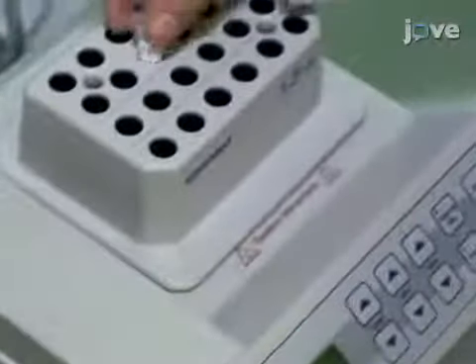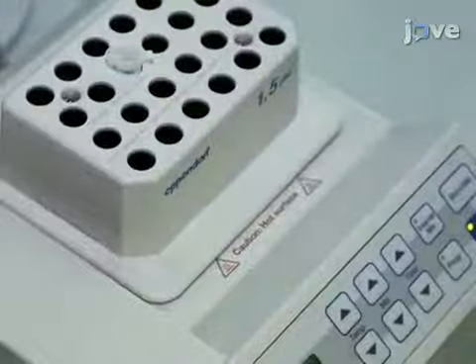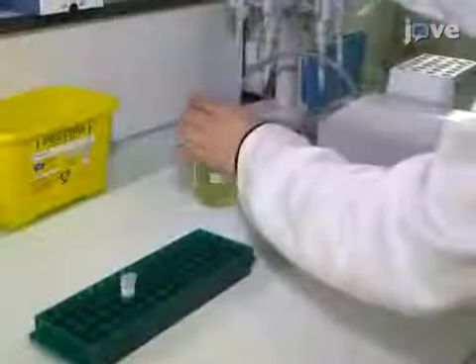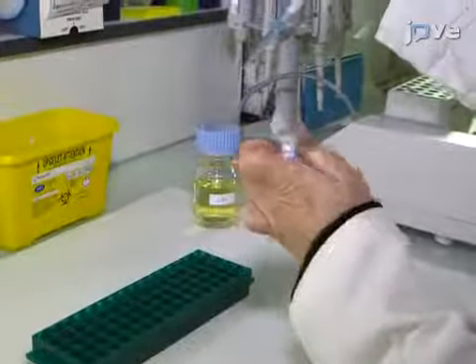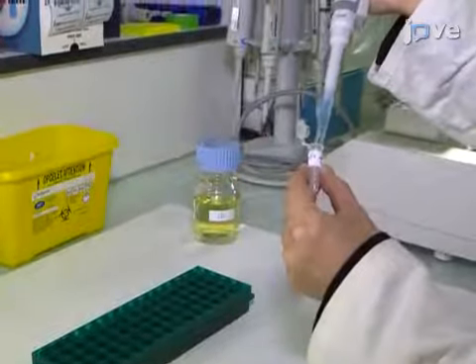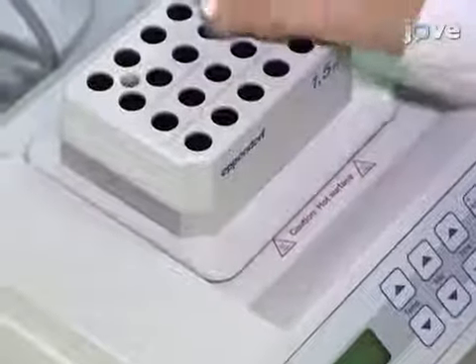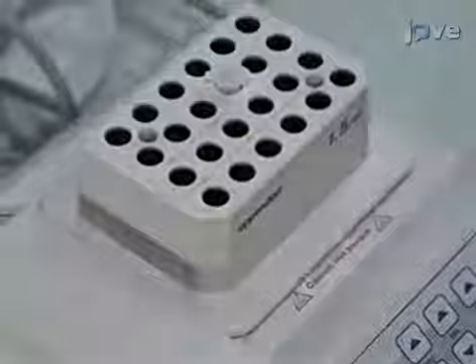After placing the cell mixture on ice for 30 minutes, heat shock it for 10 seconds at 42 degrees Celsius. Then place the tube back on ice for 5 minutes before adding 1 milliliter of room temperature Luria-Bertani or LB medium. Incubate the bacterial suspension at 37 degrees Celsius for 30 minutes under gentle agitation.